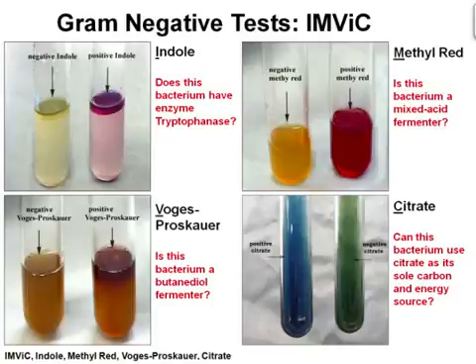For the methyl red test, the pH indicator methyl red is added to a tube containing the organism in question. Enterics that subsequently metabolize pyruvic acid to other acids, for example Escherichia coli and Proteus vulgaris, lower the pH of the medium to 4.2. At this pH, methyl red turns red. A red color represents a positive test.